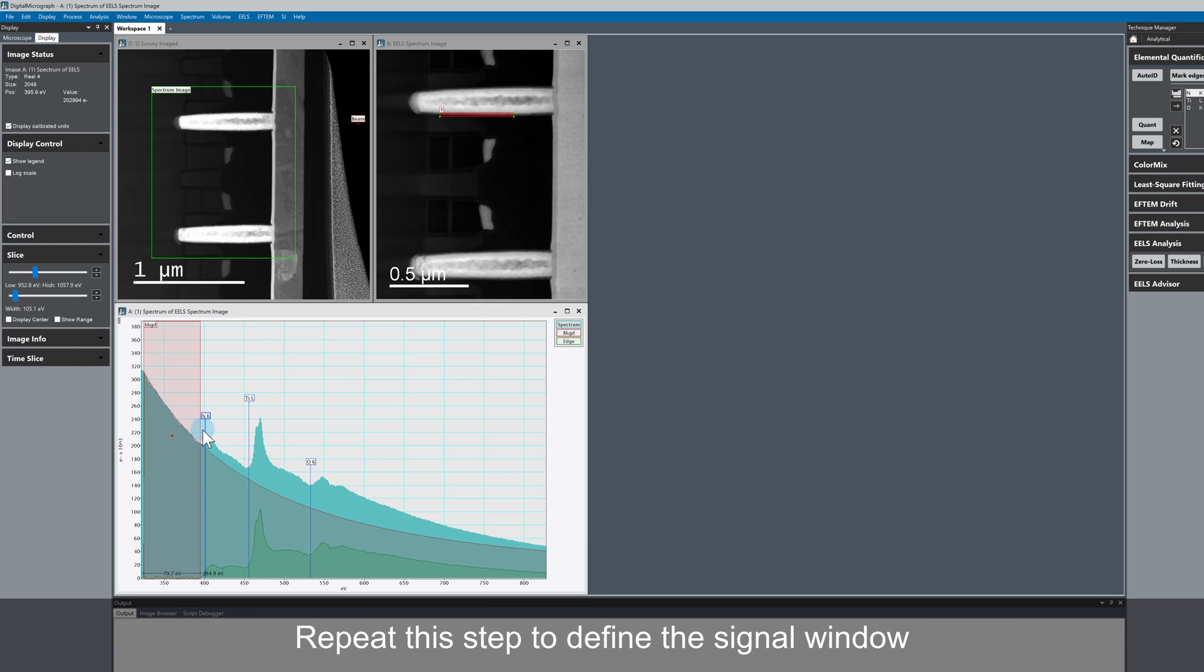If we do the same again, control, left click and drag, then we define a signal window and we're good to go.